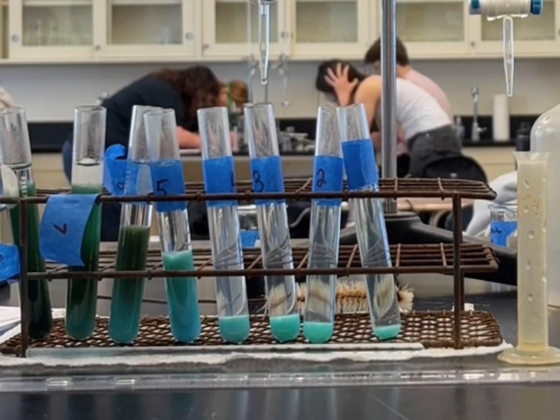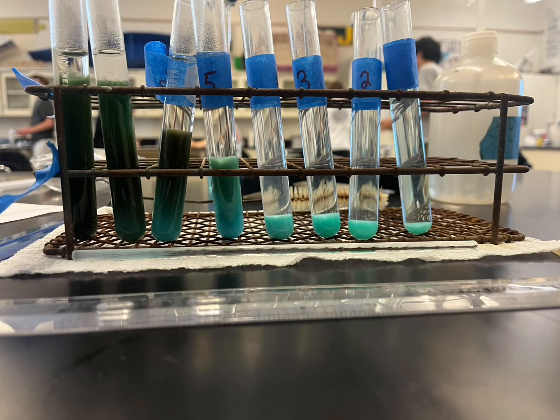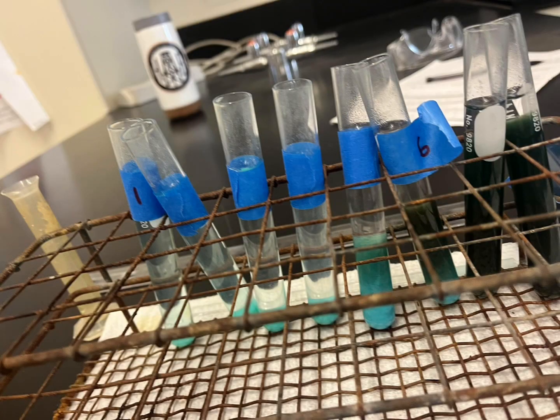Our experiment was inaccurate in test tubes 5 and 6. We believe this is because we did not put enough KOH, which kept it as a limiting reactant, causing the height of the precipitate to be less than expected, and closer to the height in test tubes 1 through 4.